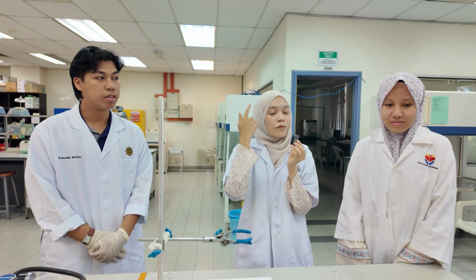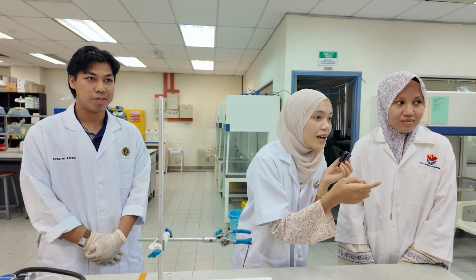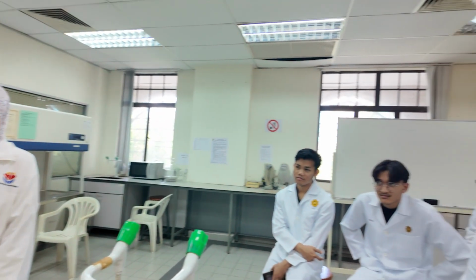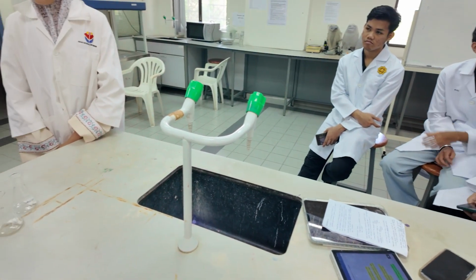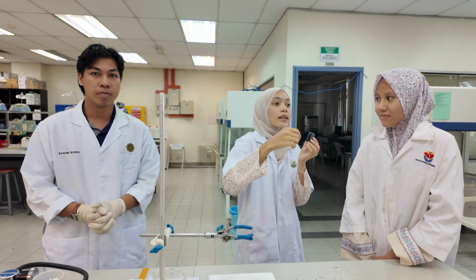For example, a common example: when we have a headache, what medicine do we take? Yes, painkiller, aspirin, that's good. Aspirin undergoes recrystallization to purify acetylsalicylic acid and remove the impurities. That's why we can take the medicine safely.